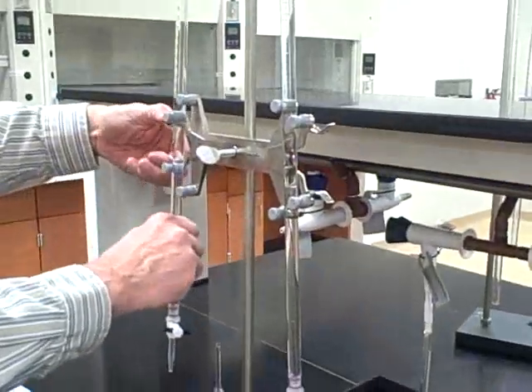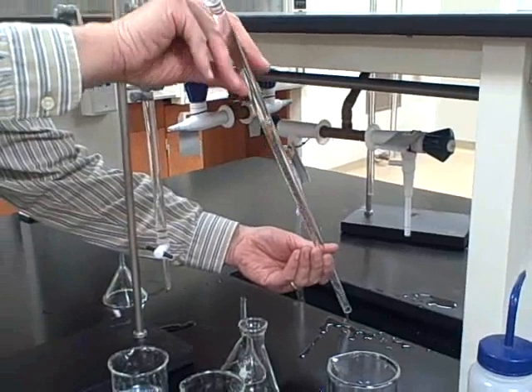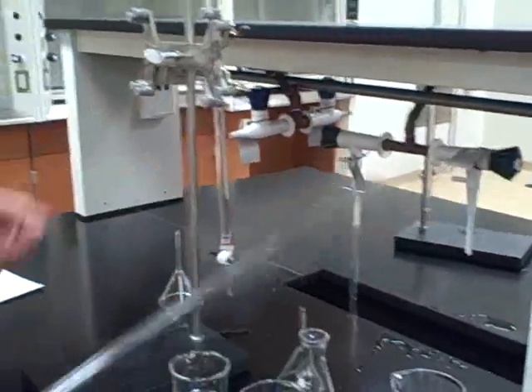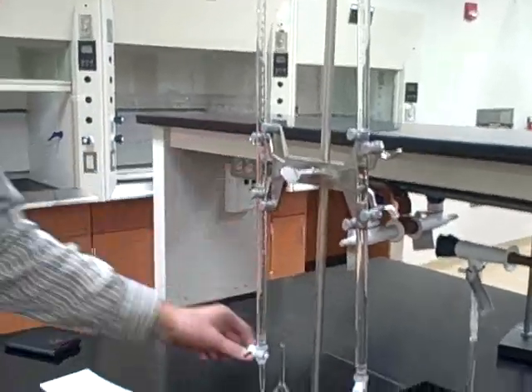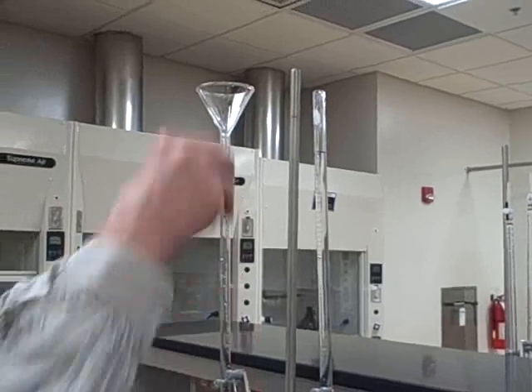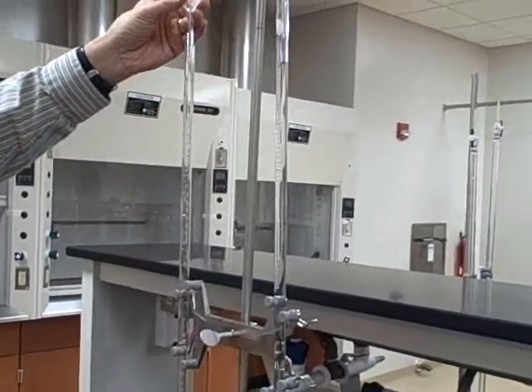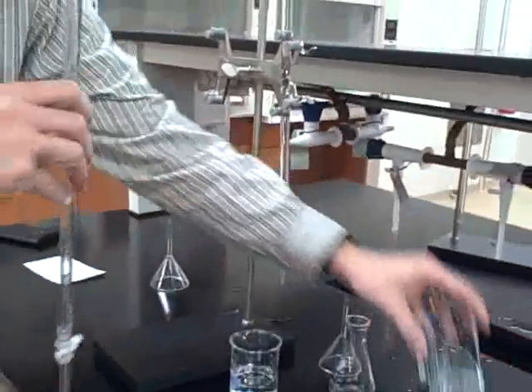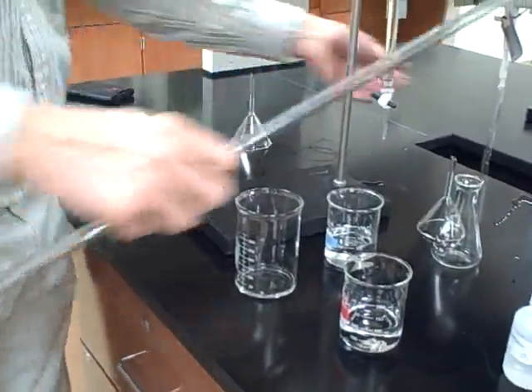The first step on using the burettes is to pour out the water. To be able to get the kind of precision that you want with a burette, you need to make sure that everything in the burette is the solution that you're using. So you rinse it a couple of times. Part of the prep is to be sure the burettes are flushed with the solution that you're using.